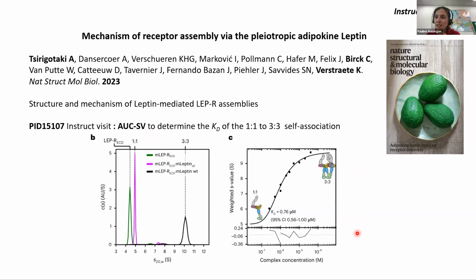So the first one is about the FIDA instrument. What is your experience with elongated non-globular proteins, Catherine? Alors, elongated, I don't know, but I have some experience with unfolding protein. In case of unfolding protein, you will measure a much higher hydrodynamic radius than you expect for a protein of the same size. Thanks. I guess the user can ask more questions in the chat if needed.